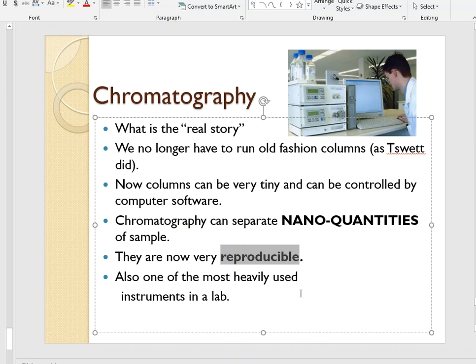There's hundreds of thousands of dollars that go into chromatography instrumentation, and Merck Pharmaceuticals is just one of them. If you go down to our pharmaceutical company in Wilmington, who's now called Alchemy, they will have 90 or more HPLC systems just in one room alone. Just one room.